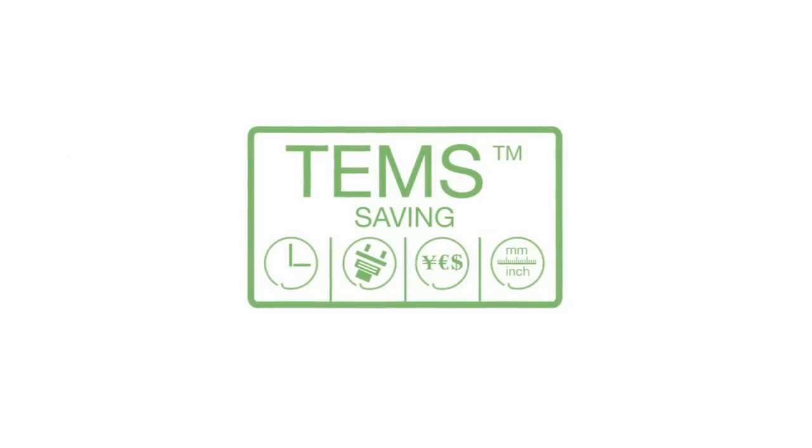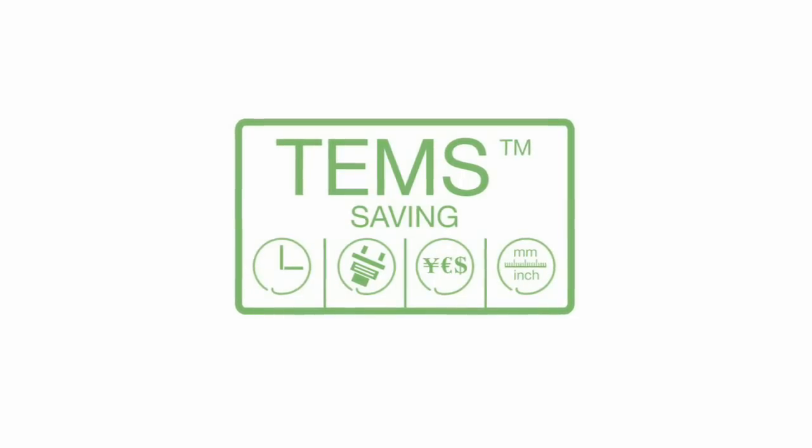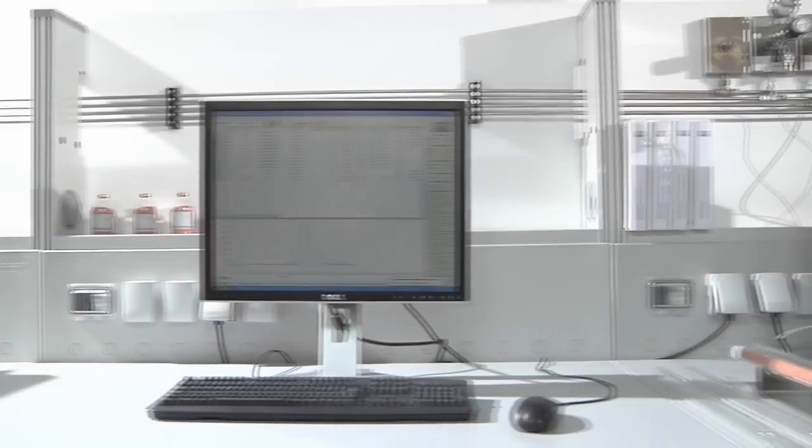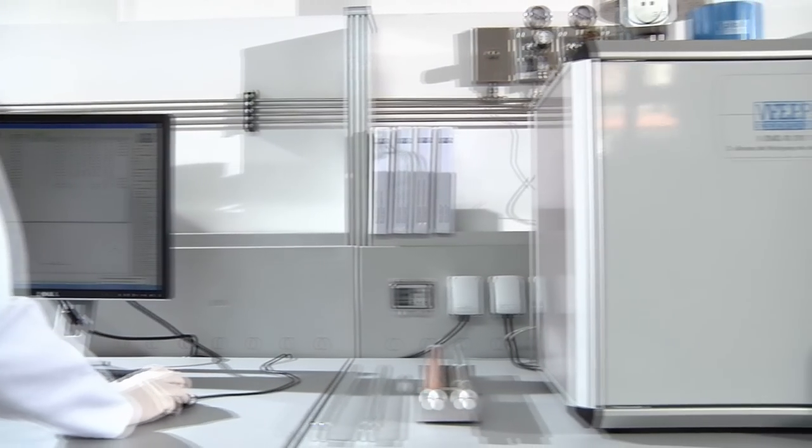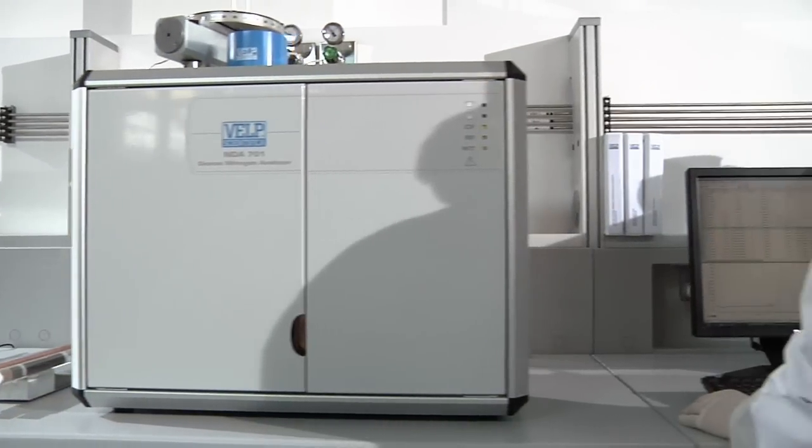The NDA701 incorporates the exclusive TEMS technology saving time, energy, money, and space.